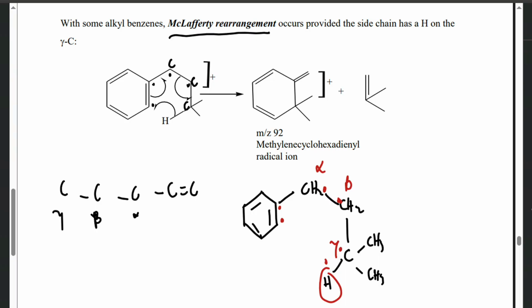This double bond is repeating the direction. This double bond breaks, there's a gap here. This one breaks, there's a gap here, and this one breaks here, like this. So this is the direction we're heading to. So basically this one joins with this one, right? So this one joins with this one, right? And this one joins, remember that this one will be leaving, joins with this one.